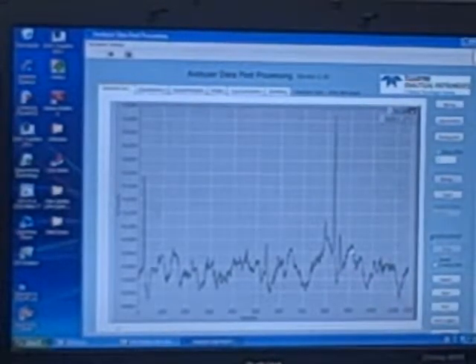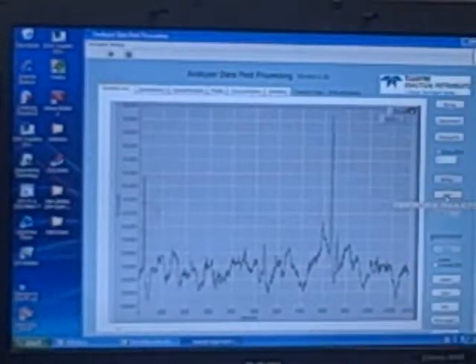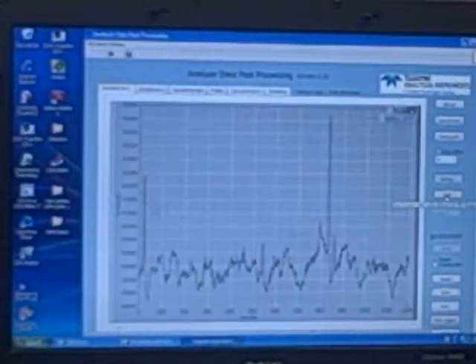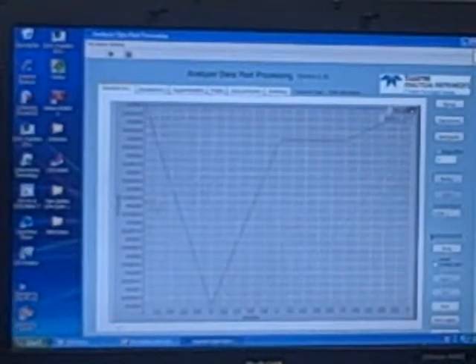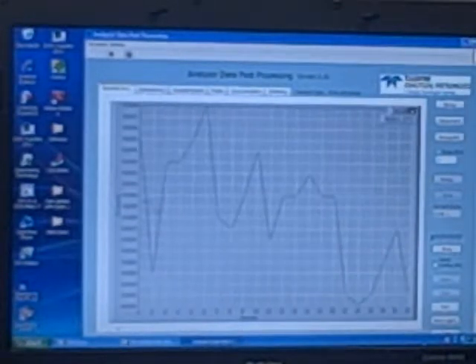Everything's ready except that it doesn't start saving until you tell it now we go, because you are satisfied with everything. You double check gas pressure, temperature, everything okay. I say go. You're ready to go anywhere. And after 2 cycles you come back, it will be there. Okay?